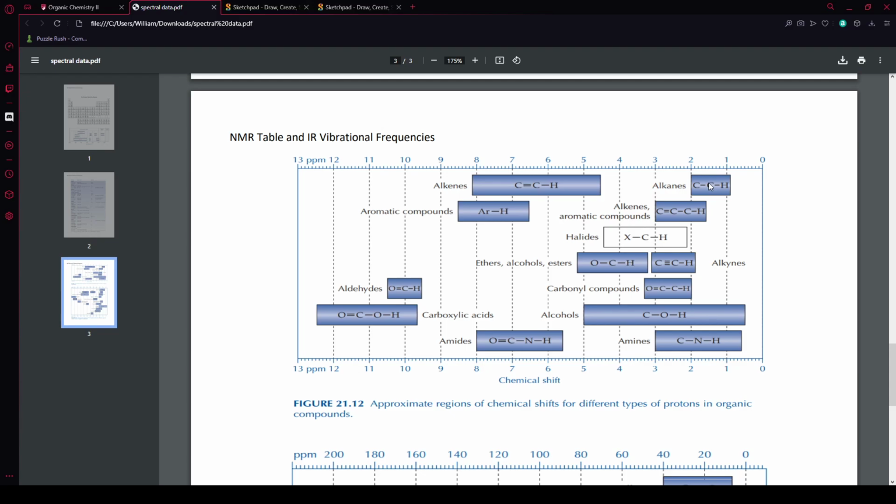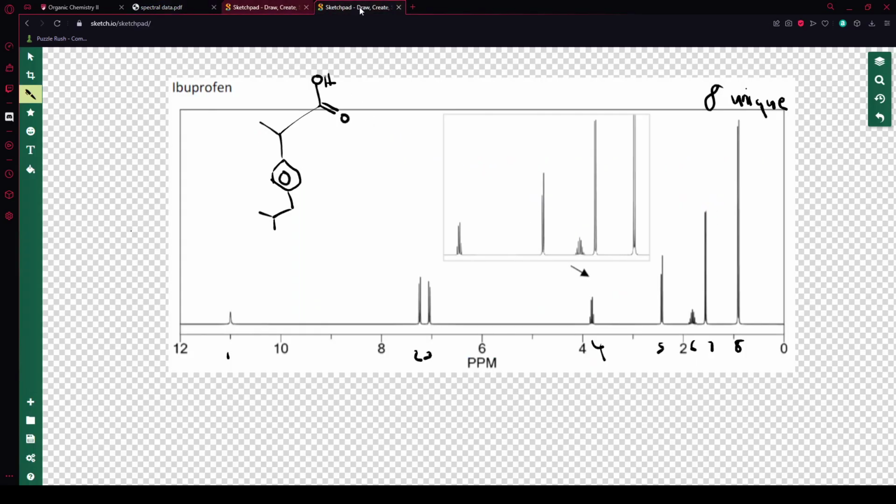So I know I went fast. We already kind of showed you this. Slow down if you need to, but hopefully you get what I'm going at. I just copied down where on the graph each peak was, and then I looked at the literature to see what potentially these peaks could be.